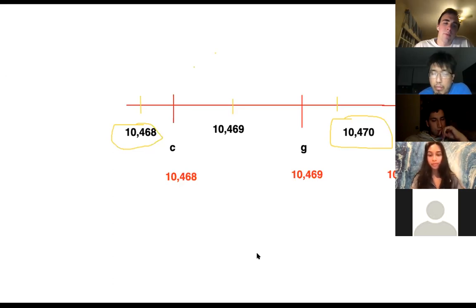Okay. Tony, do you see this? Yeah, I think that makes sense. Okay. Yeah, you're using 2 that way. When you take the difference, it shows up as 2 nucleotides instead of 3. Yeah, I get that. Okay, Yang? Yeah, it makes sense.